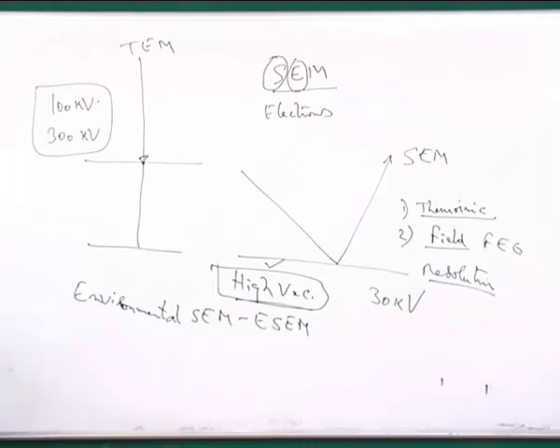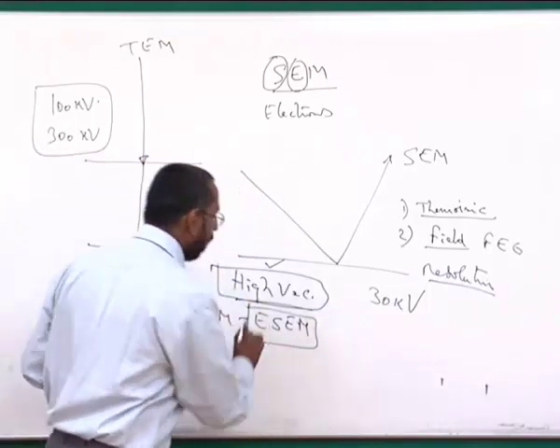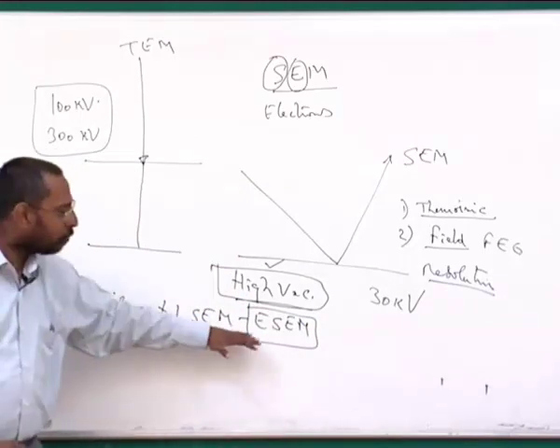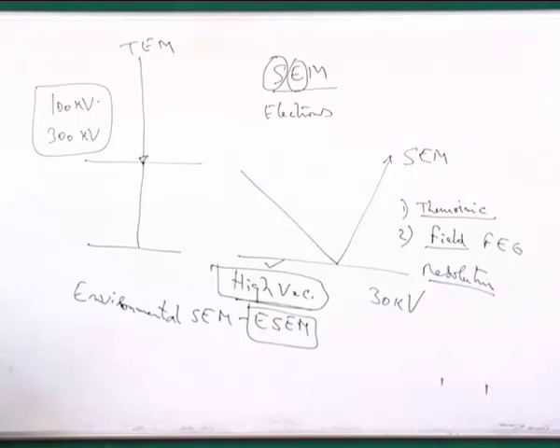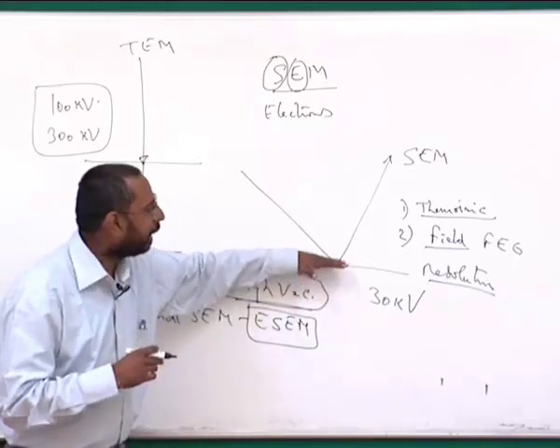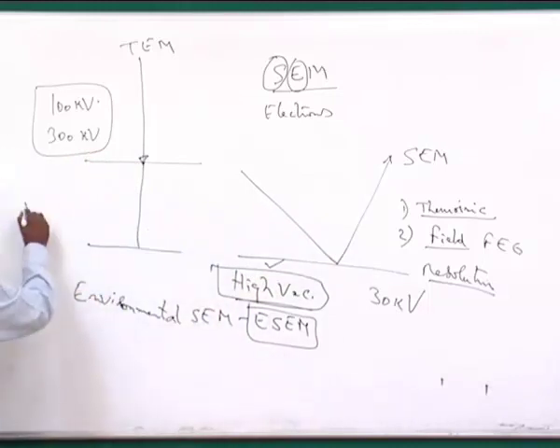So these are certain new advancements that have taken place in electron microscopes, that now you have these ESEMs available and quite a number of people are going into buying these ESEMs, where you will be able to get a lot of information. Of course, at the same time, ESEM also has a problem in terms of the resolution because of whatever little scattering takes place in the atmosphere contained between the source of the electrons and my sample.